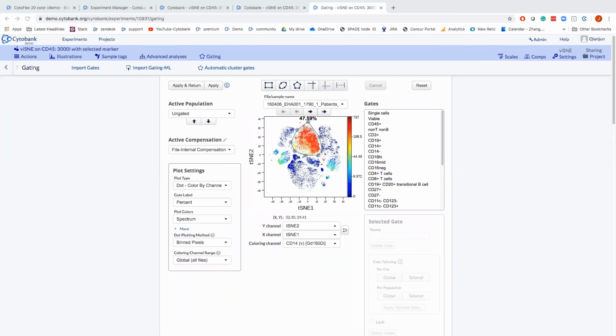Like for the data set I use, increasing an additional 1,000 iterations, my KL divergence value just dropped like 0.3 points. So that's not a lot of improvement. So it's already bottomed out. If you plot the KL divergence, you will see a drop significantly at one point, and then it kind of plateaus, bottoms out.